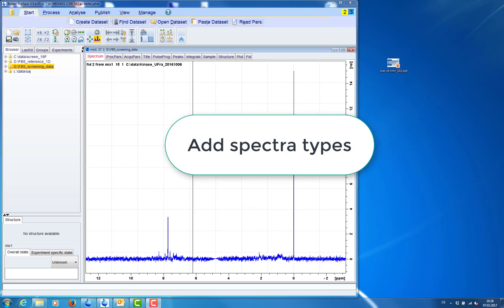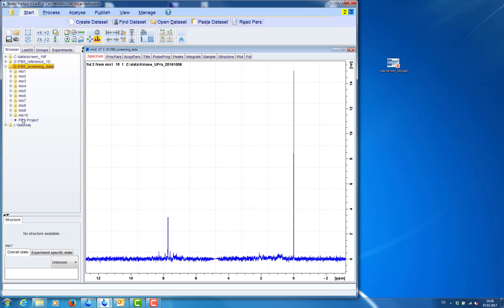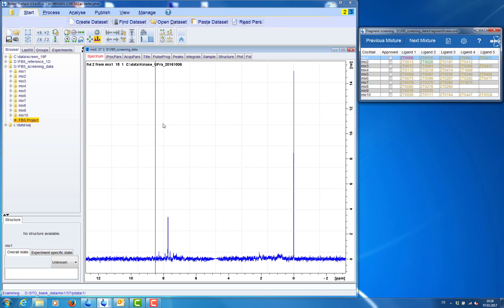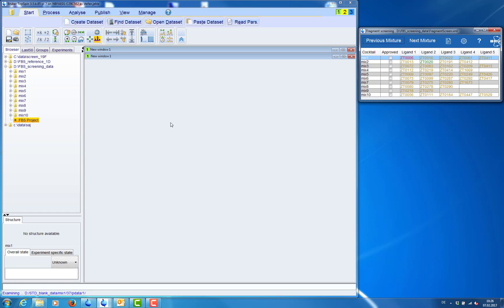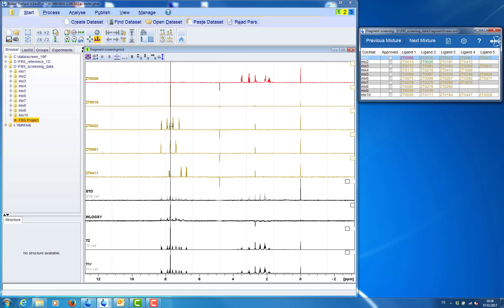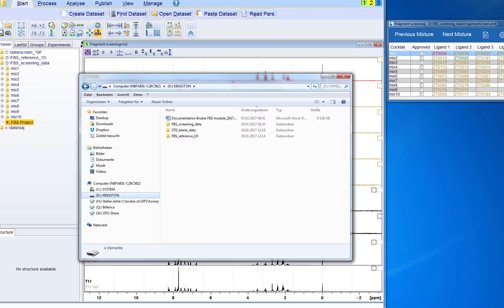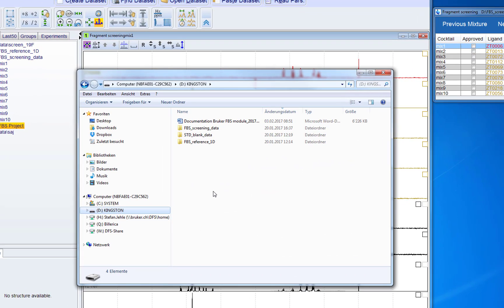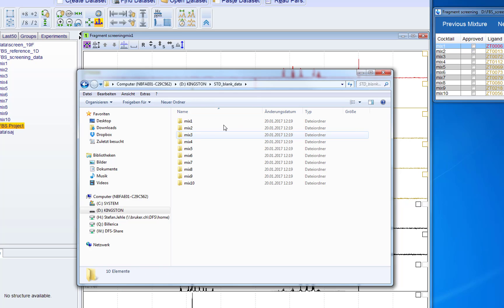Now we want to add a customized spectra type to our screening project. So first we open the screening project. And then we navigate to the spectra that we want to add or a spectra type.